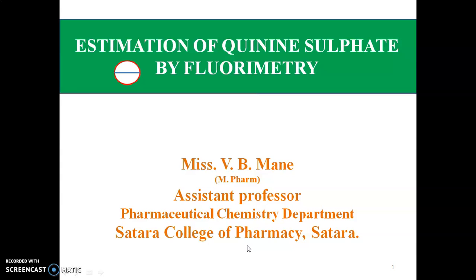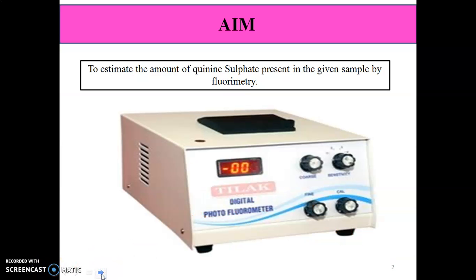In this video, we are going to see about estimation of quinine sulphate by fluorimetry. The aim of the experiment is to estimate the amount of quinine sulphate present in the given sample by fluorimetry.